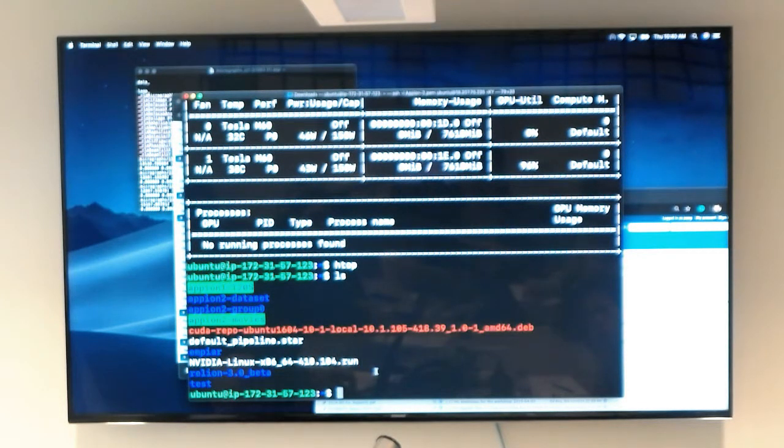So the main thing is we're going to keep your data directory pristine, and then we're going to create new directories to work in. It's really up to you how you want to organize your environment. One suggestion would be keep your raw data in one place and then create additional directories that are named in some way that is intelligible to say what you're trying to do.